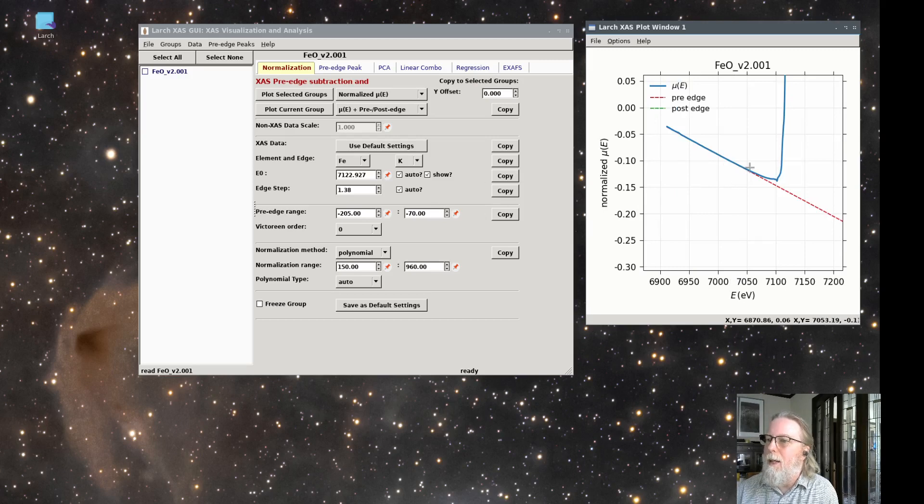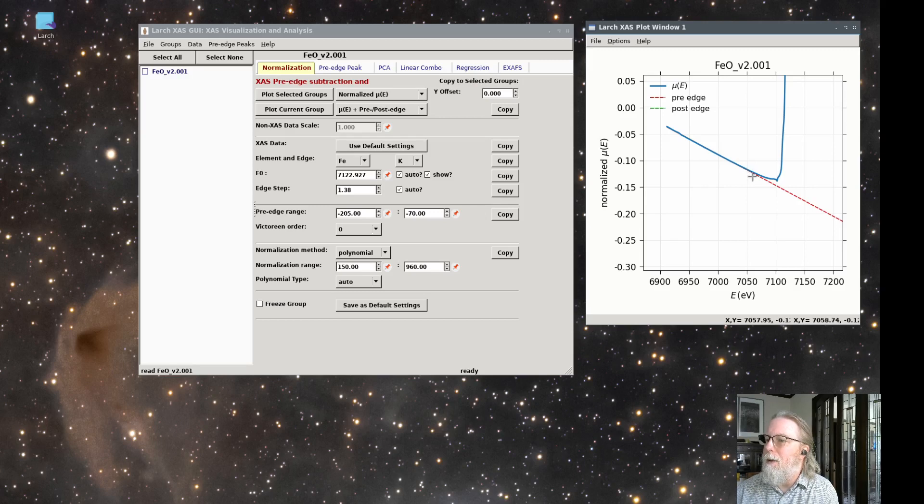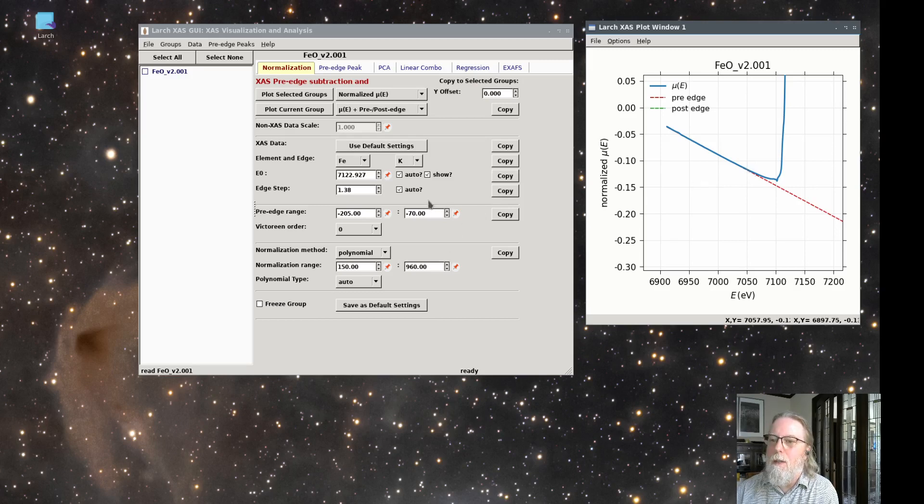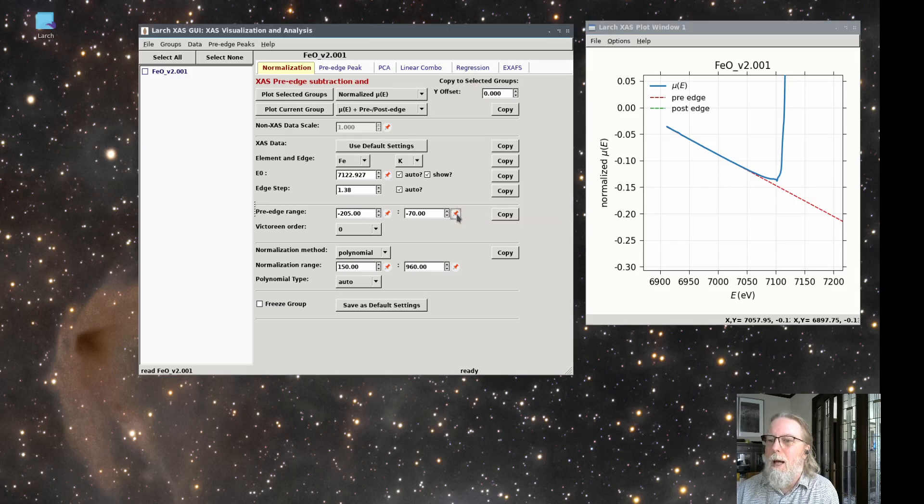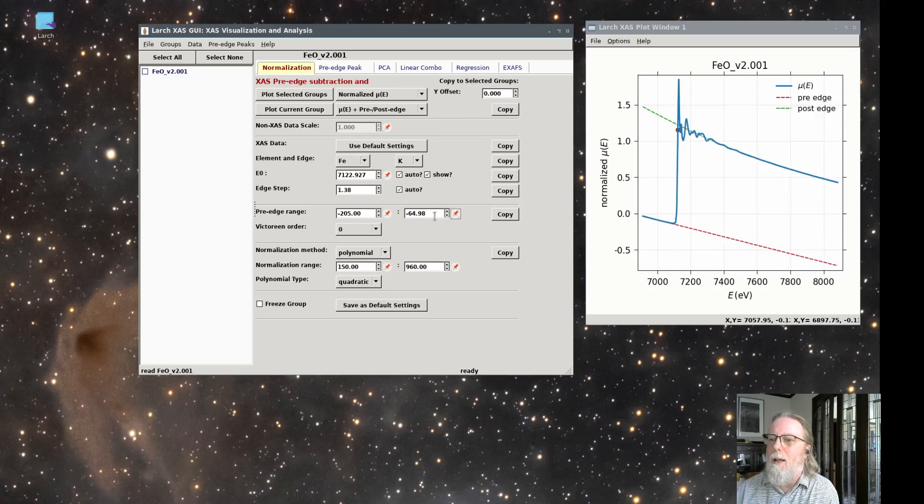So if I click on the plot, say here at something around here. I just clicked on the plot and then I come over to this form and there's a little red pin icon that says use the last selected point from the plot. So I click on that, adjusted that value a little bit.